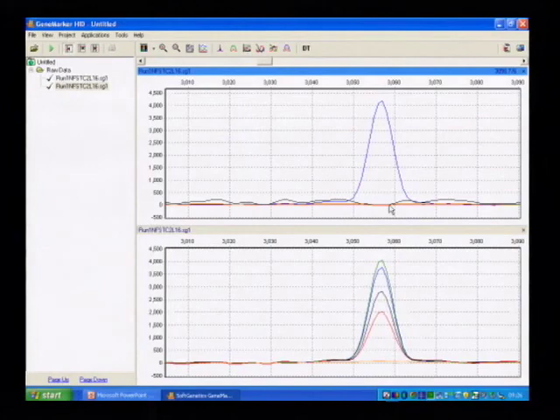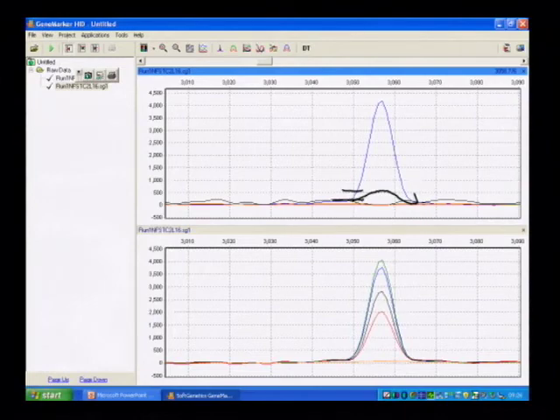Somewhere in between, this is the worst case you would get. If you had poor color correction, you may get a little bit of another color, say red or green, and it would be relatively small, but not at the level of the baseline. It would usually generate a peak, and it would be designated as an allele because it'll most likely be higher than the calling threshold if it wasn't corrected properly.